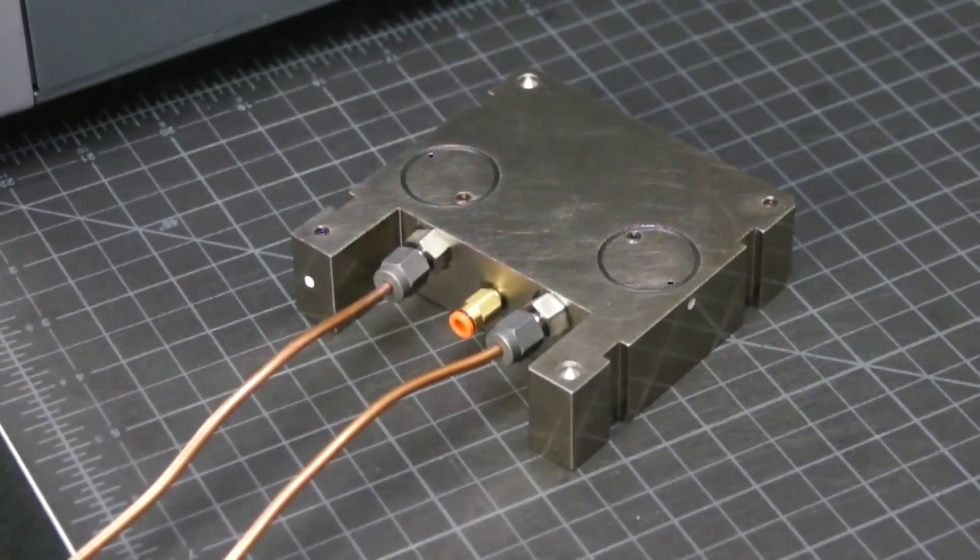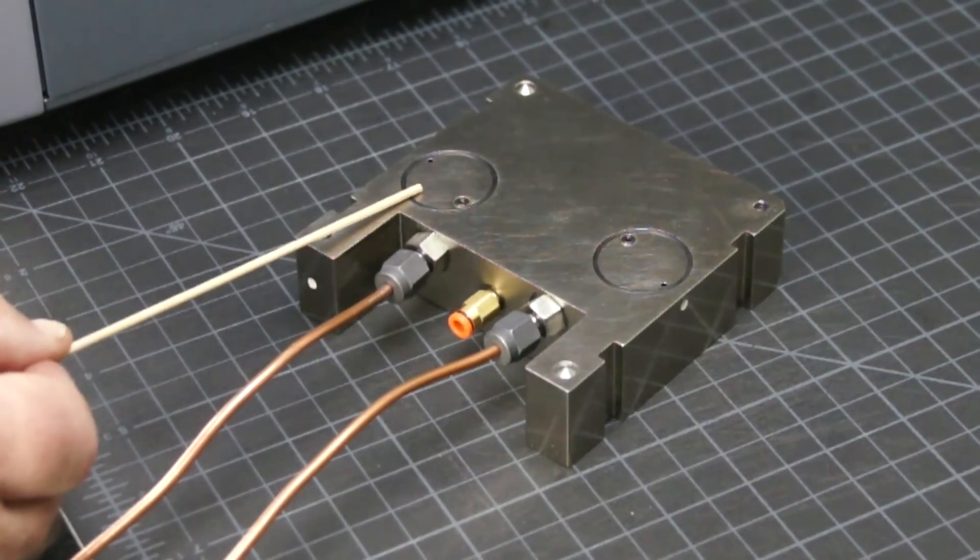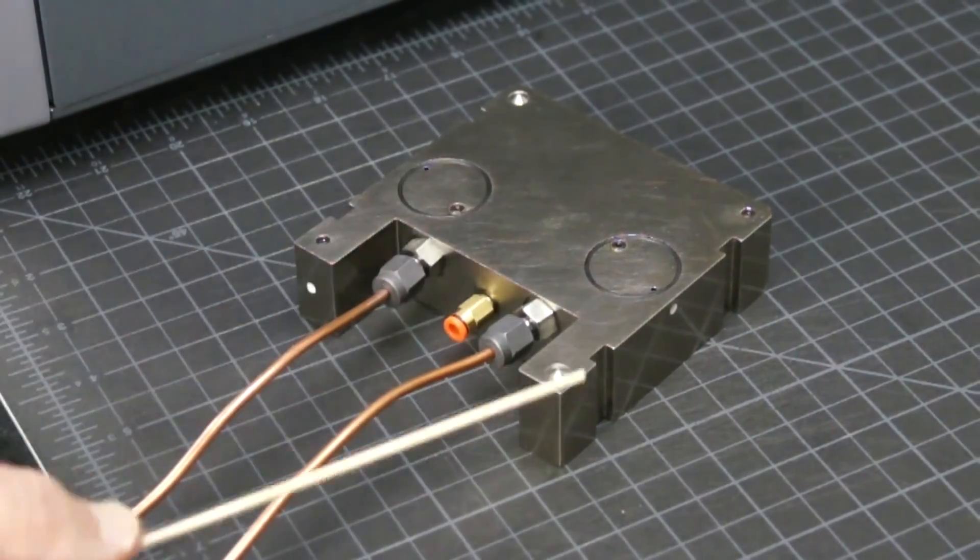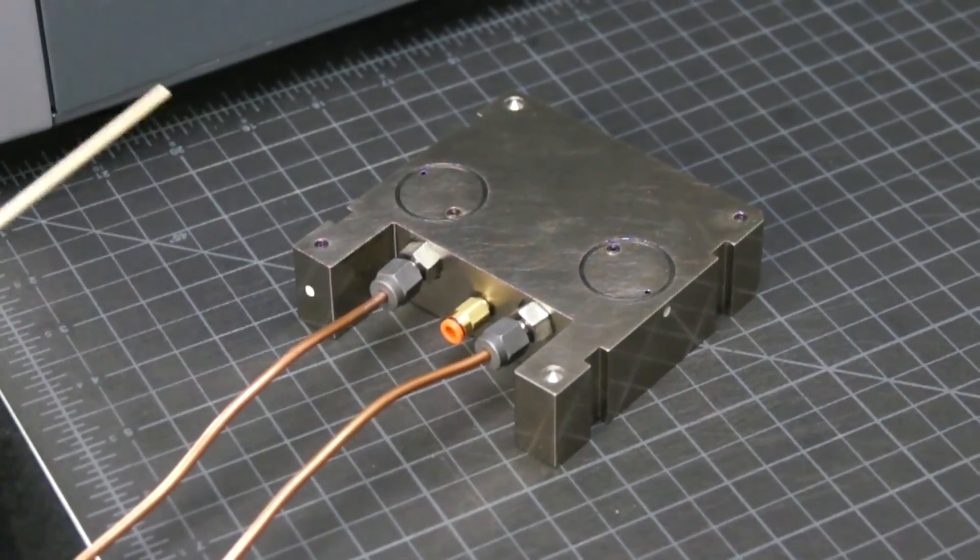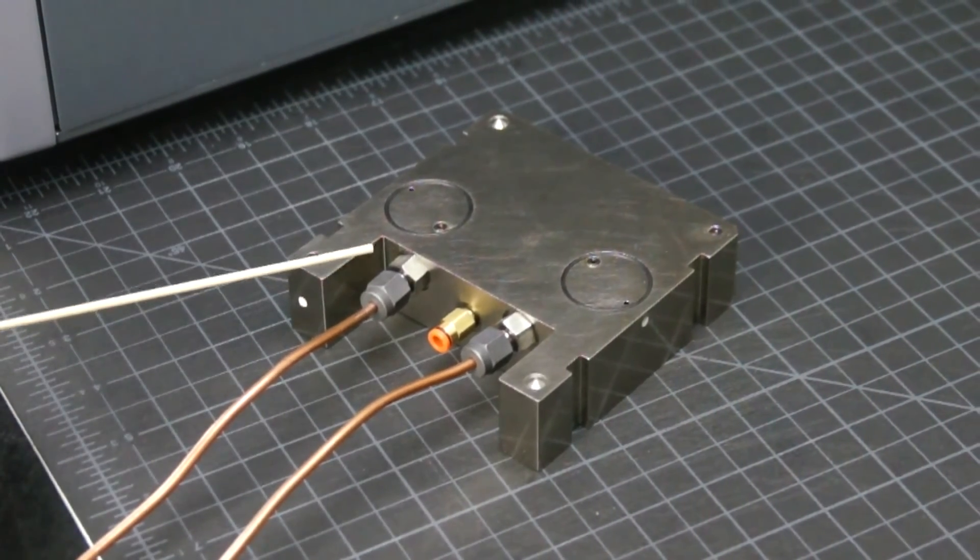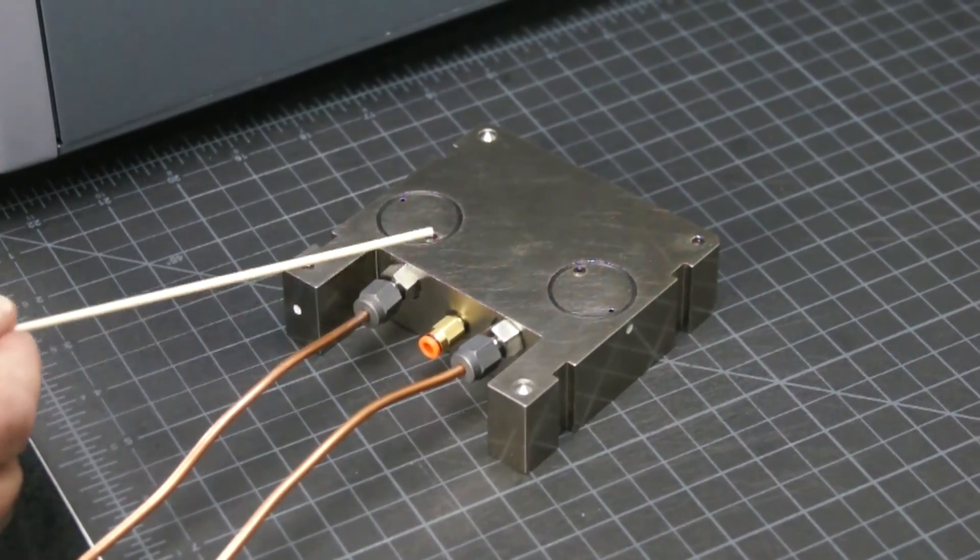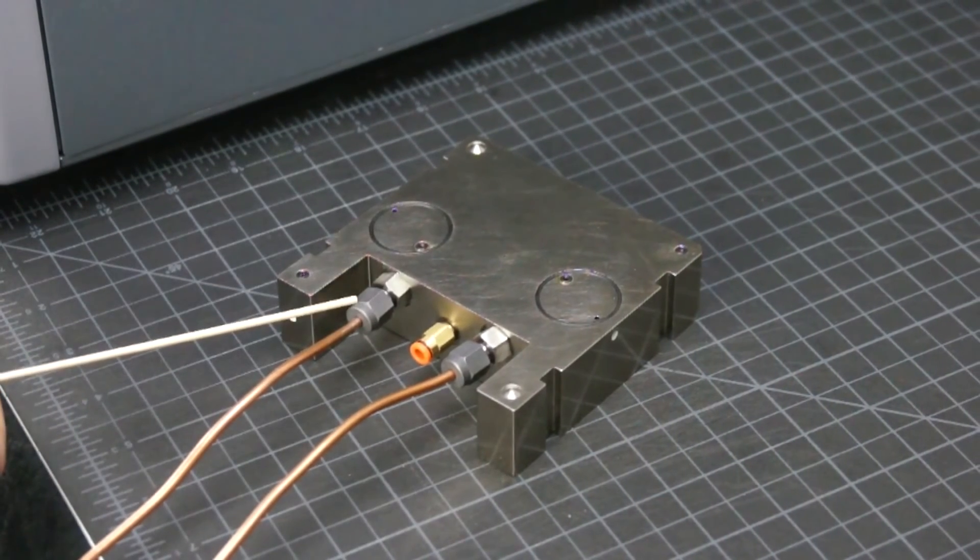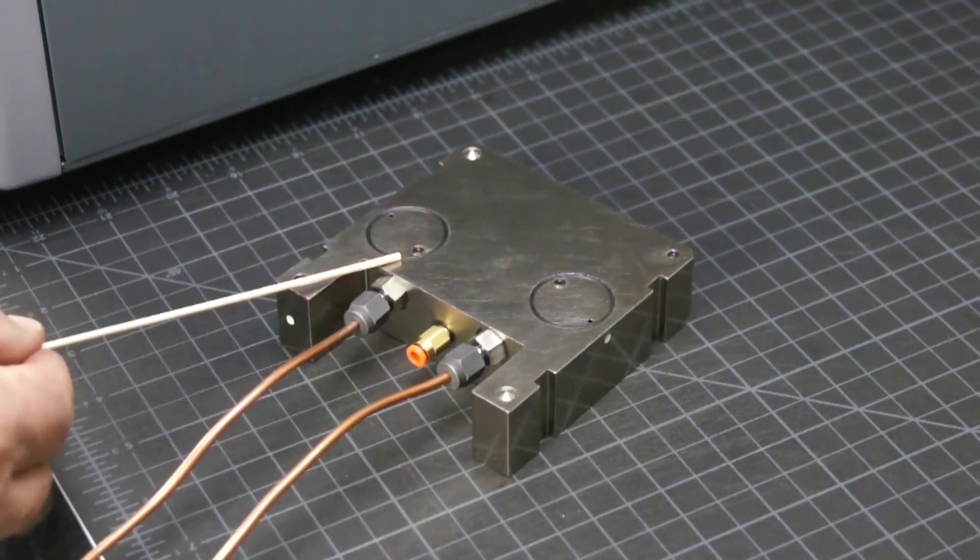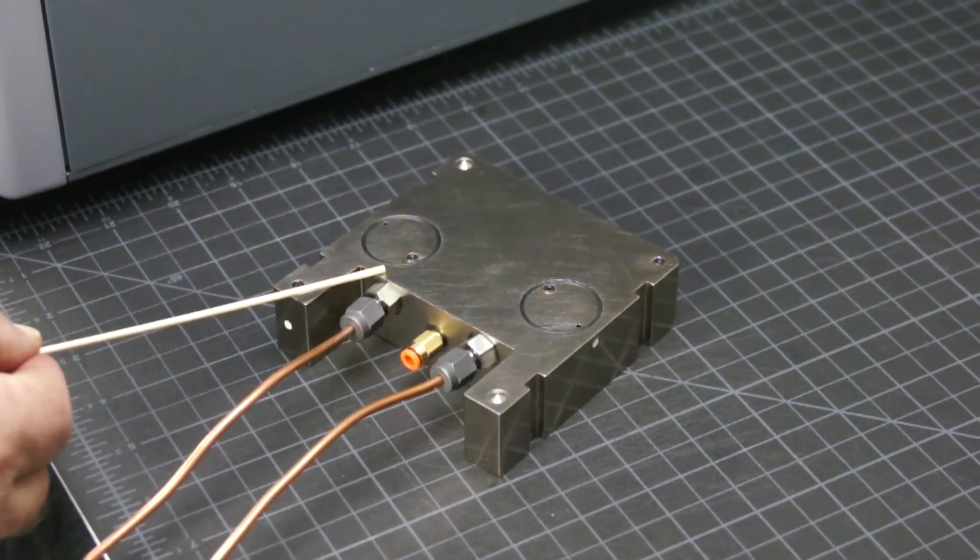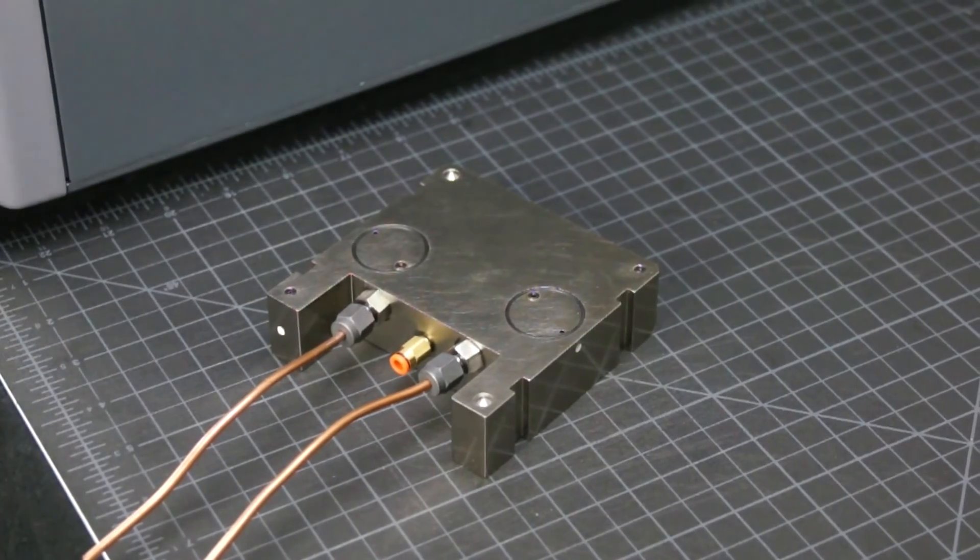Optional package testing cell adapters are available. These are placed in the drawers in place of the film test cells. You will be able to plumb these adapters directly to your package while they are on the bench, then place them in the drawers. Purchase any number of package adapters and prepare additional packages in advance for testing.